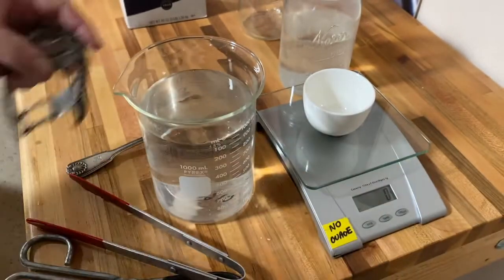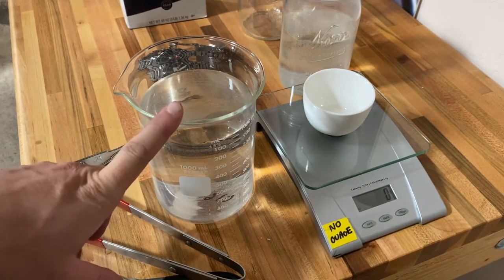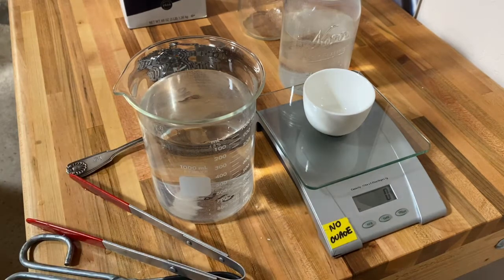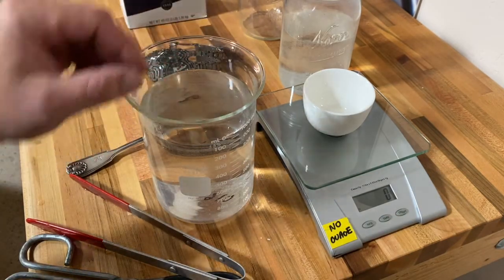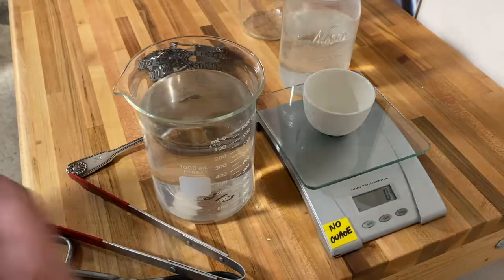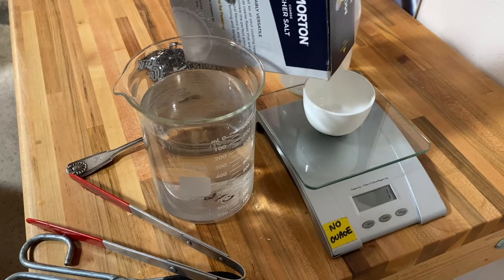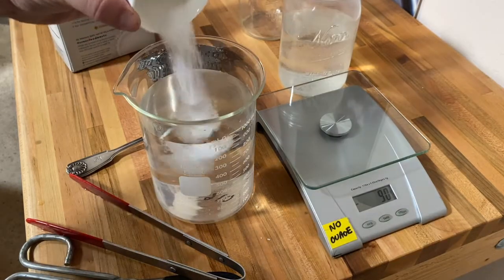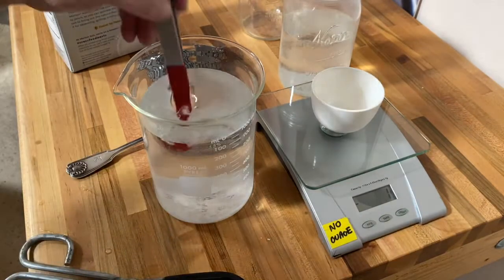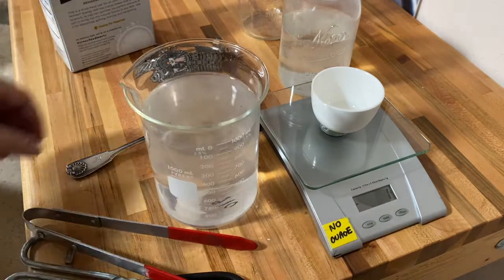I'm going to raise the concentration to 50 parts per thousand, which is hypersaline — like a salt lake, where you have a much higher concentration. We're going to measure out some more salt, about another 15 grams or so. I'll dump it in, and just got back from the microwave with this fully dissolved.